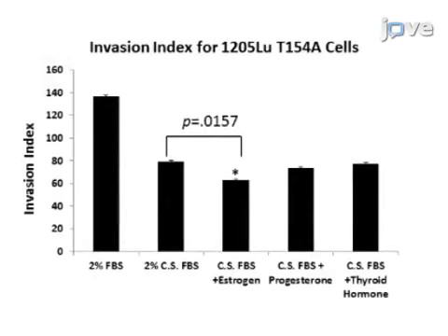The results show the changes in the invasion index for specific cell populations that occur during migration toward known experimental factors, based on the normalization of the results against the invasive index of non-invasive cell populations.